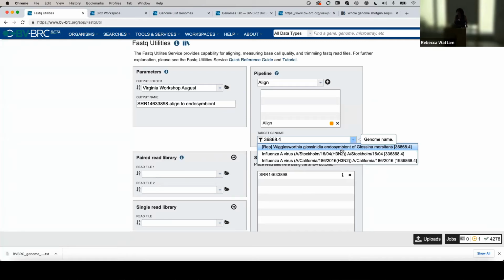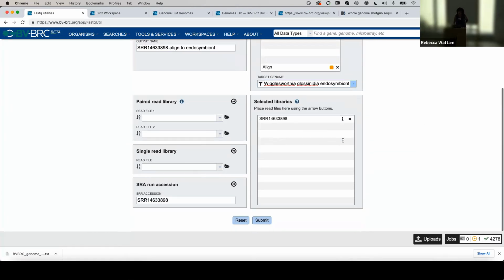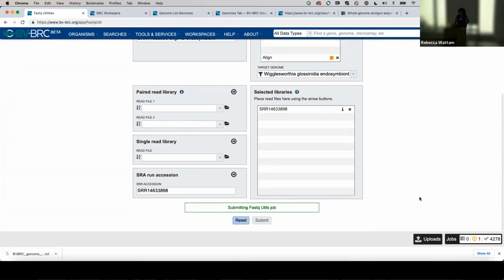You need to be able to click on Wigglesworthia yourself, but I know you can do it. I can see that you all have that ability. So click on that, and then we can submit that job. And that job has been submitted, and let's wait until I see it. Oh, good. It's been successfully submitted.